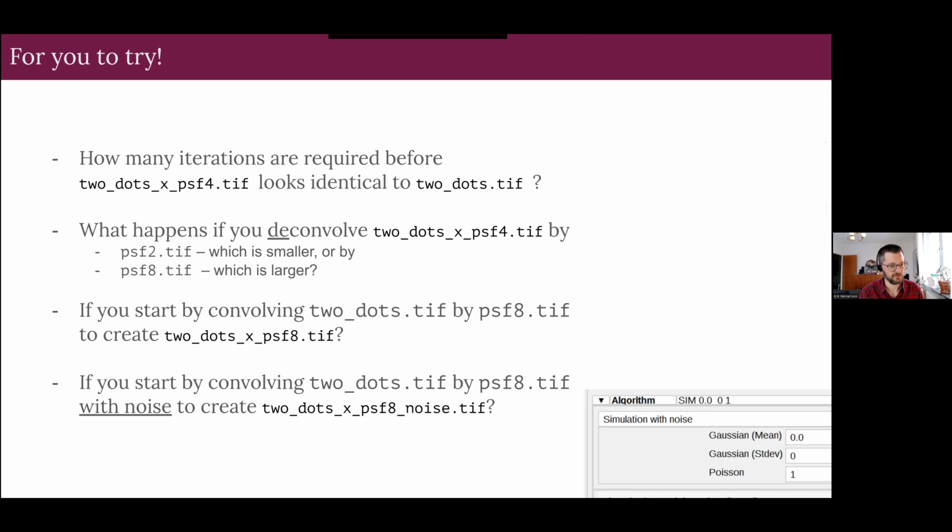But now that you have it set up, I thought of 4 things you could try if you find any of them interesting. The first question is, how many iterations do you need before this deconvolved image looks identical to the input image again?